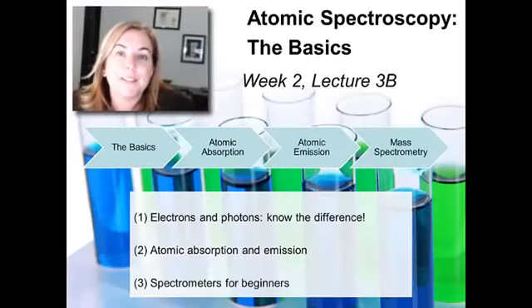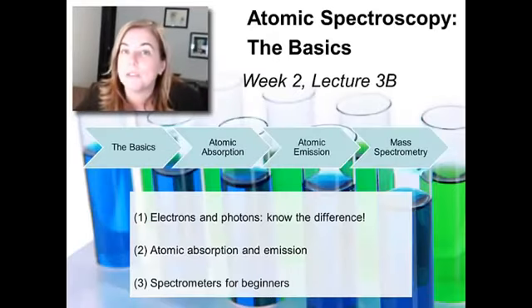So I hope you've gotten a sense of the basics of atomic spectroscopy. We'll be moving now more into the instrumental world, about how these things are put together and some of their advantages and disadvantages.